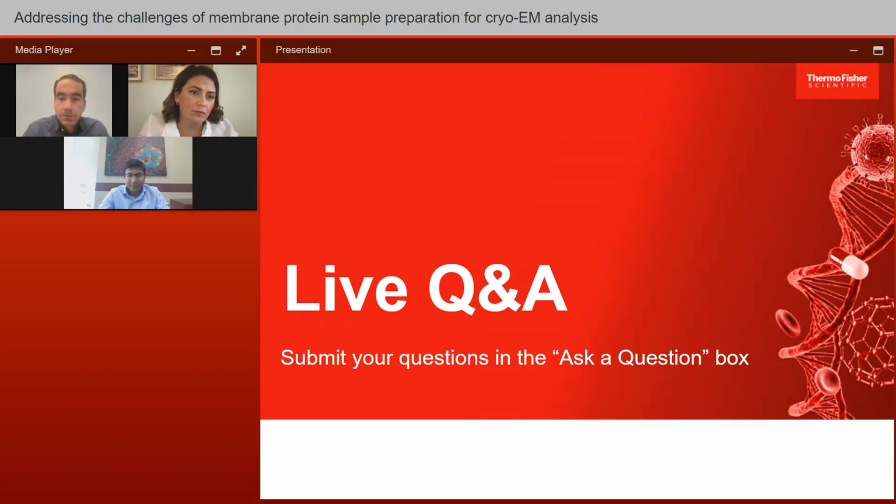So maybe for Rosie, for the Fab technology, are there other factors that should be considered in selecting the right Fab besides what you talked about, binding affinity and changes of function of the protein? Are there other things that should be considered? Yeah, often you do get multiple Fabs from these screenings. I've had up to 40 come through.